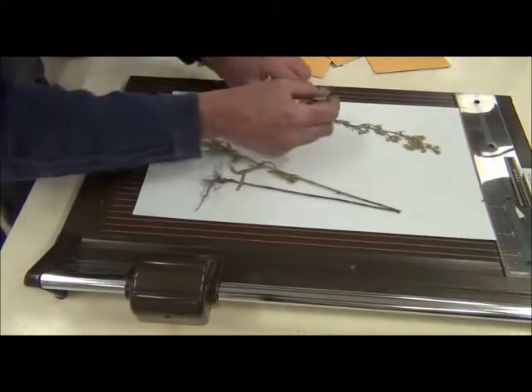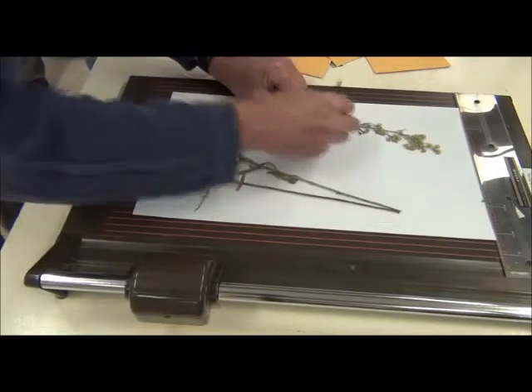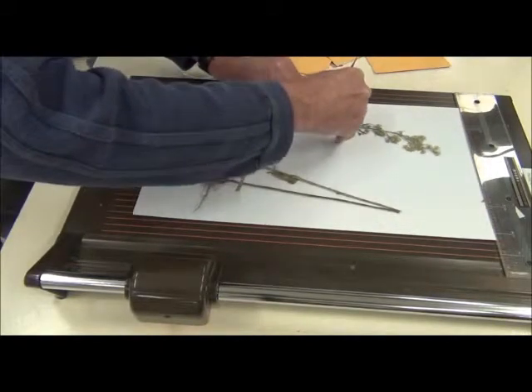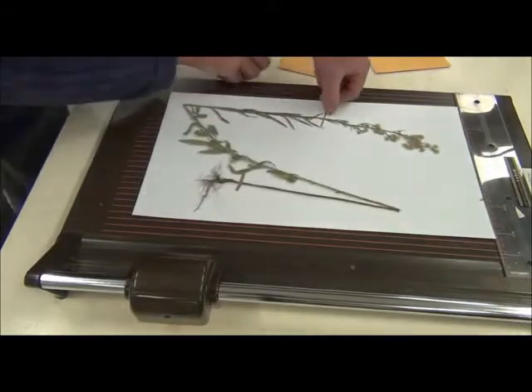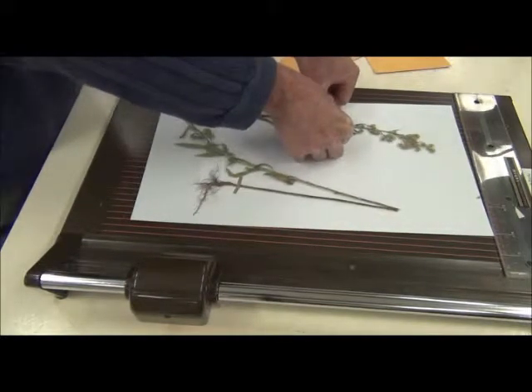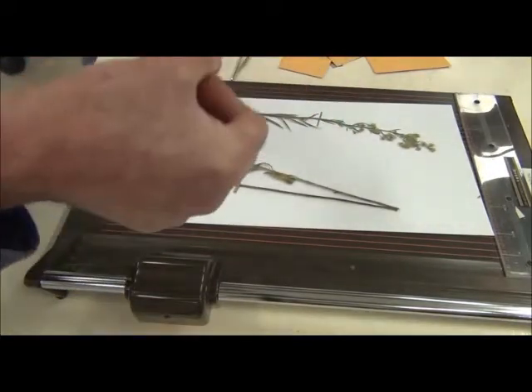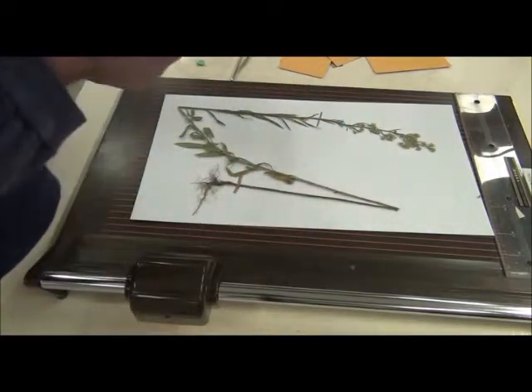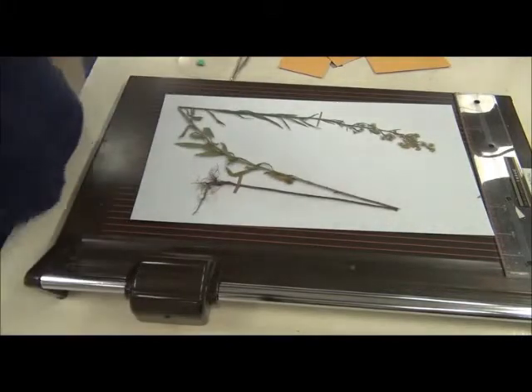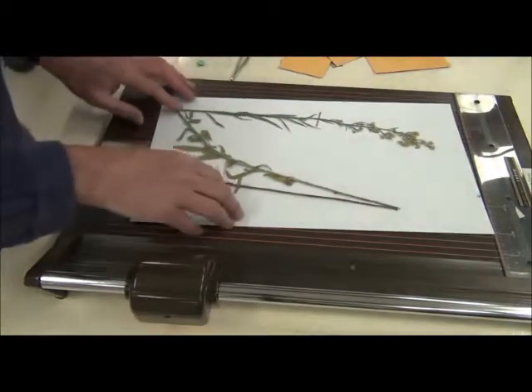Again, I'm going to grab the forceps and use the back of the forceps to... Nice. Okay, and hold that on for a few seconds. And I'm sort of pushing in, but not so much that I'm going to tear the paper, but I'm pushing in to try and get that contact with the stem and with the base.